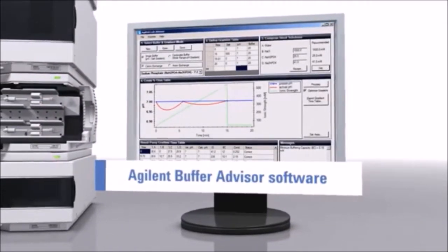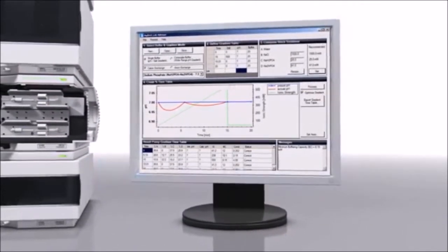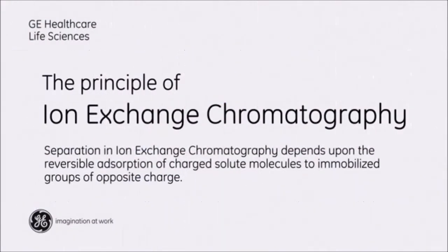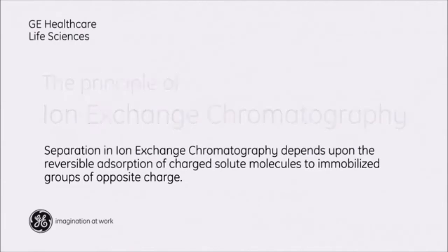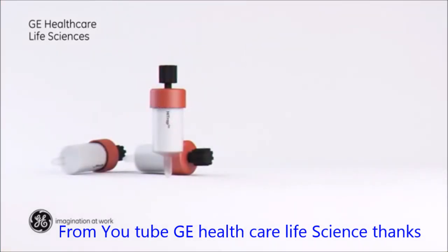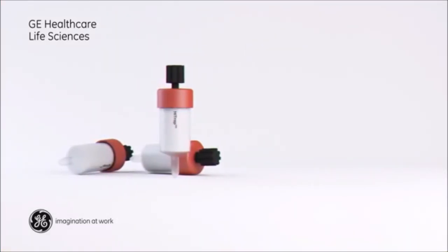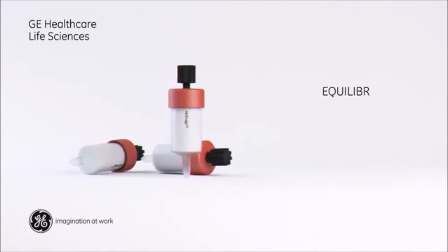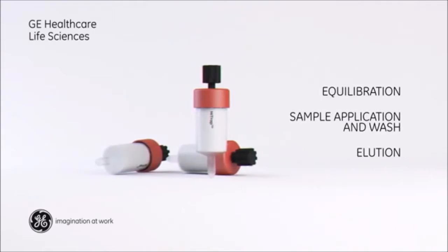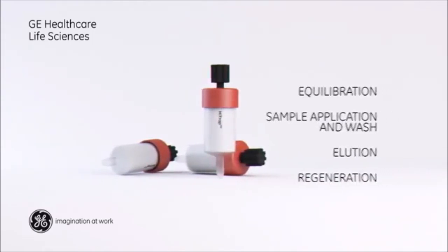Agilent Buffer Advisor software provides a fast and simple way to create multiple salt and pH gradients. Separation in ion exchange chromatography depends upon the reversible adsorption of charged solute molecules to immobilized groups of opposite charge. Most ion exchange experiments are performed in 4 main stages: equilibration, sample application and wash, elution, and regeneration.